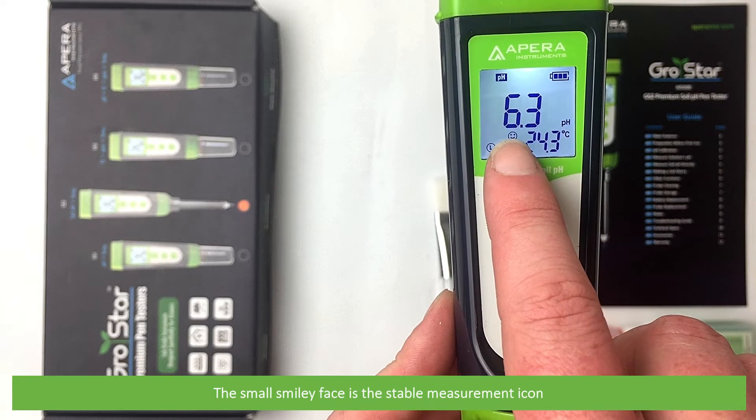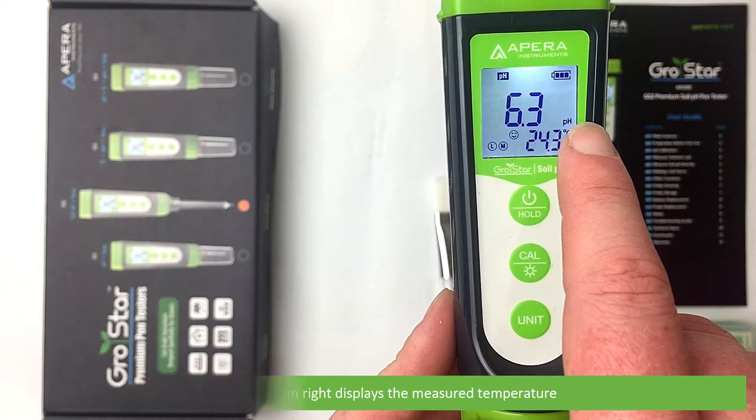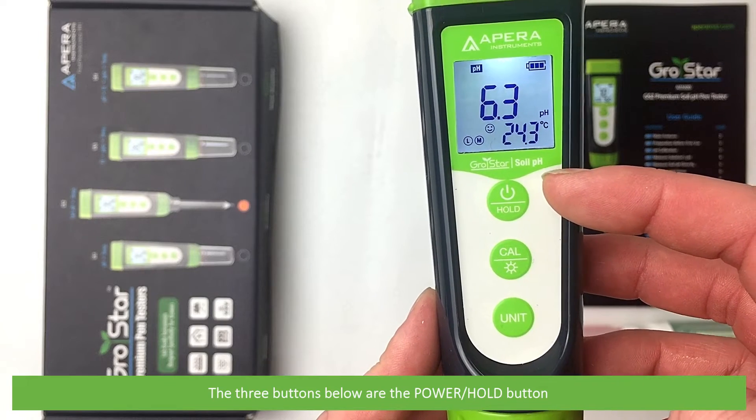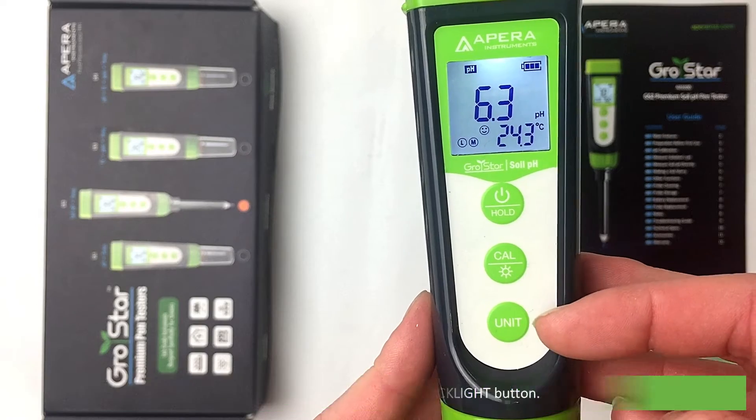The small smiley face is the stable measurement icon, and the bottom right displays the measured temperature. The three buttons below are the power hold button, the center button is the cal and backlight button, and the last button is unit.